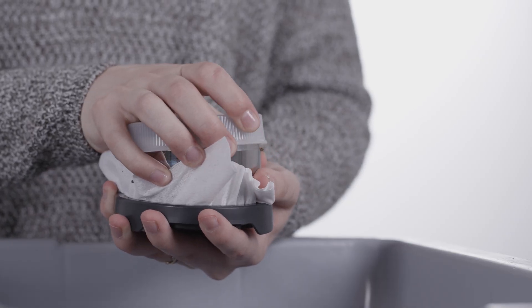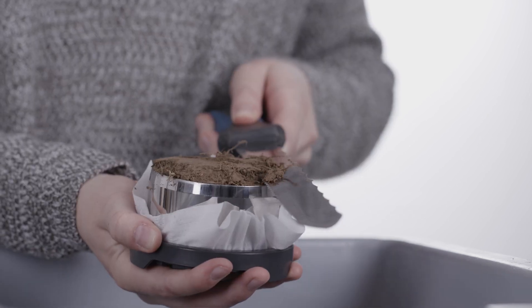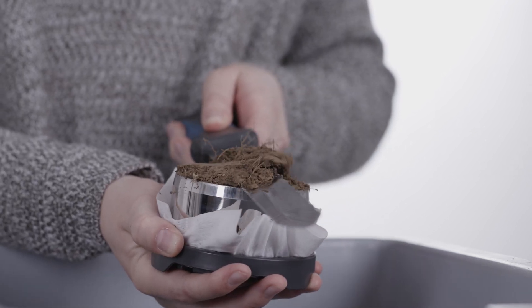Turn the soil sample upside down and remove the cap from the bottom of the sample ring. Prepare this side of the sample with a saw blade or knife.